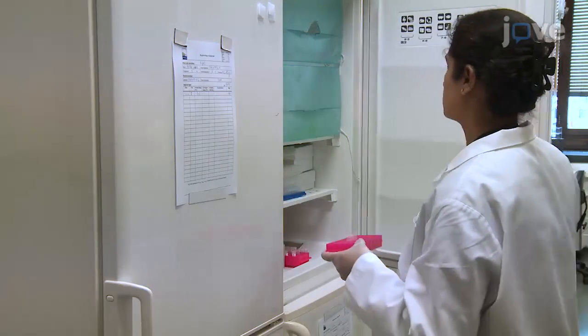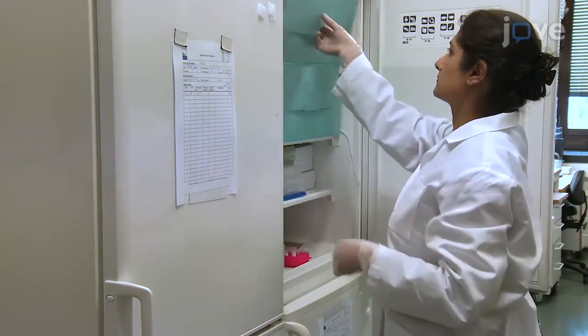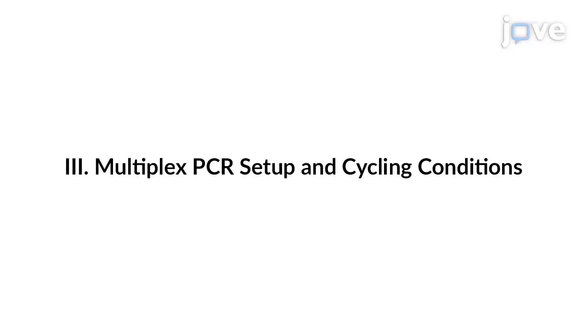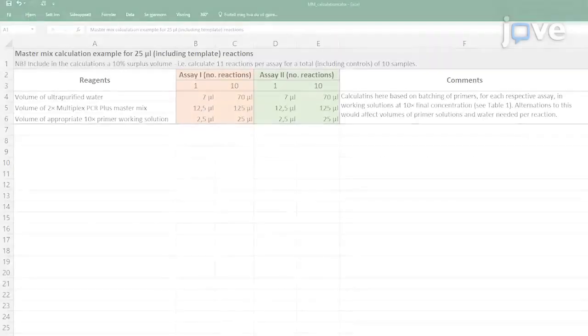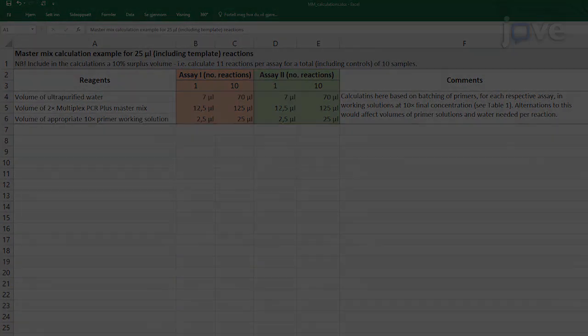Proceed to the next step or store the DNA at minus 20 degrees Celsius. To prepare master mixes, first calculate reagent volumes according to the number of samples.